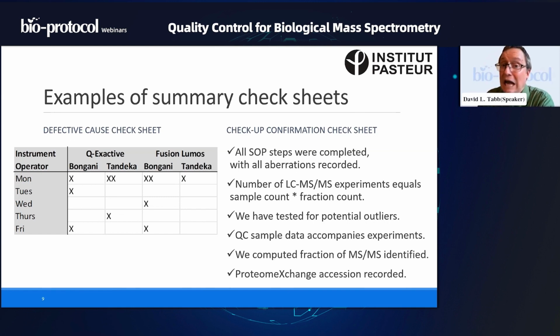Because you'll be surprised how often it is that a user comes to the core facility and says, my samples were great, but your data look terrible. It happens all the time. Anyone who's worked with a core facility probably just winced and their heart shrunk a few notches as I said that, because it happens all the time. So yes, having quality control data to show that the instrument was fine, the sample, however, was not working well with our technology is definitely worth being able to demonstrate.